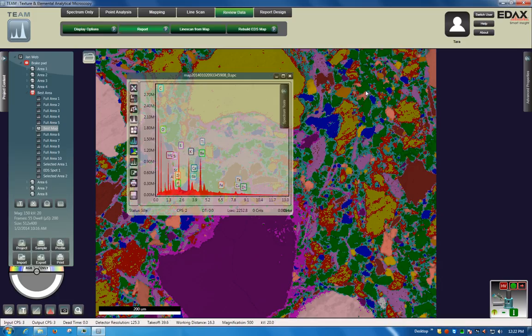This concludes the overview of the TEAM data export options. Thank you.